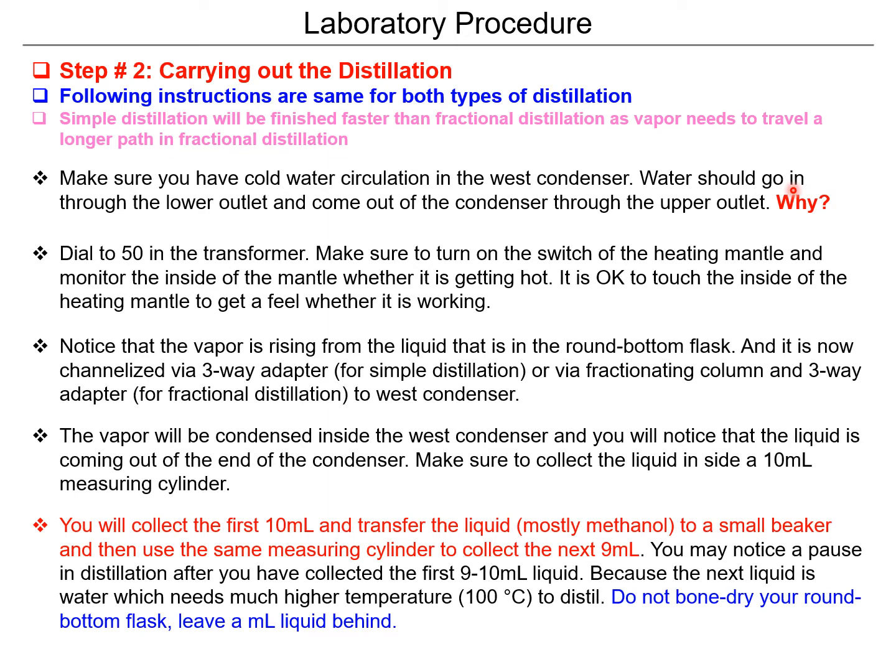Now, the first thing you should note, you have to attach cold water to your condenser, right? It has to be circulating. And one important thing to note is it has to be coming from the bottom. Now, why is this, right? Well, if you take your condenser here, right?